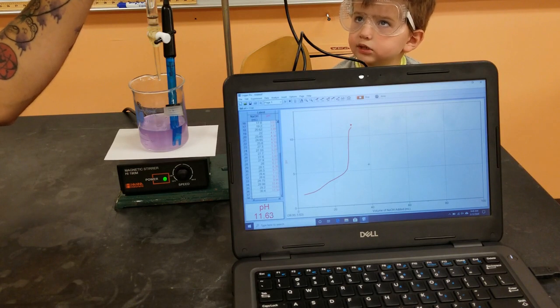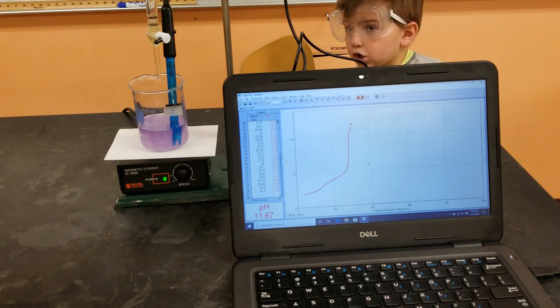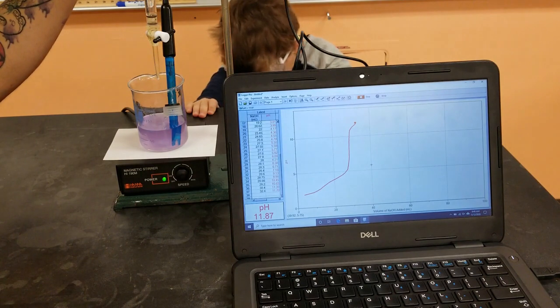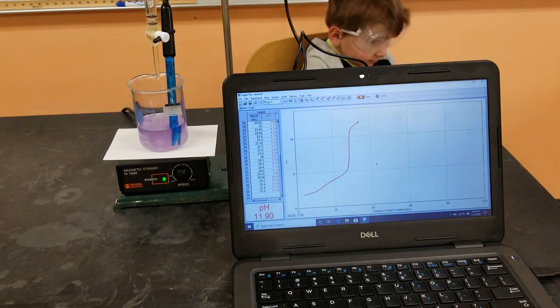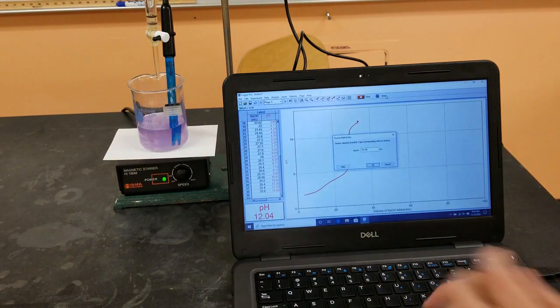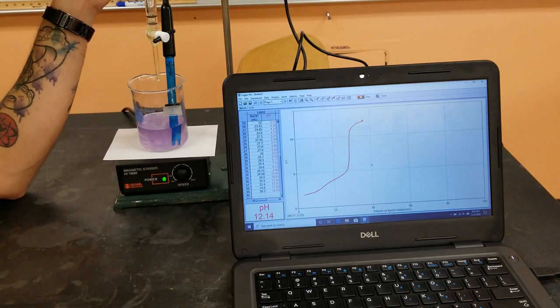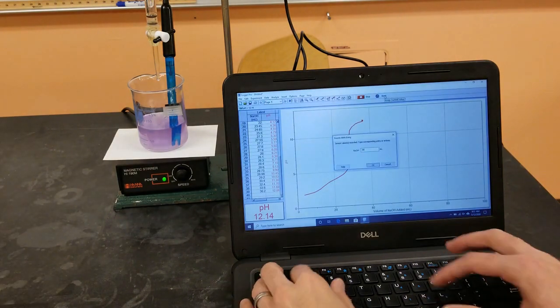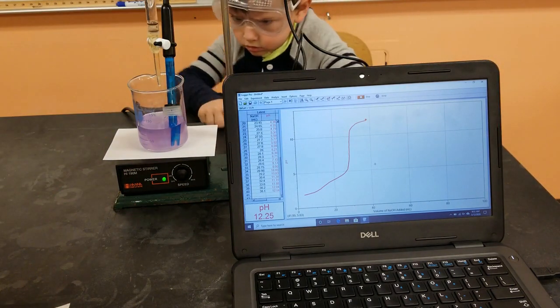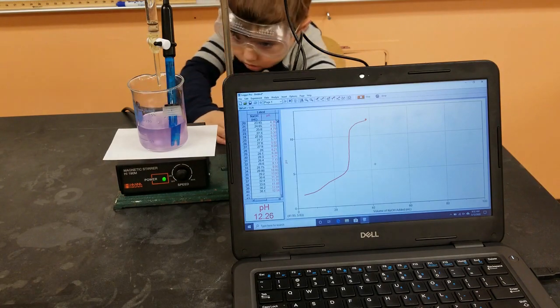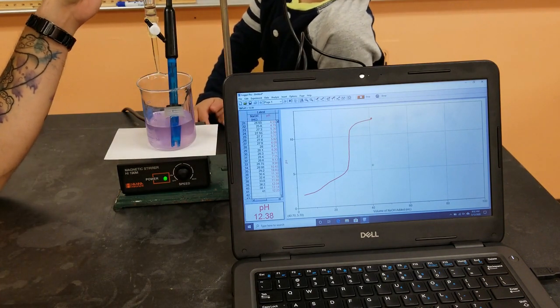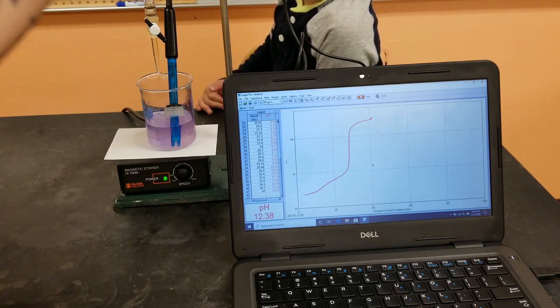Now we're at 32.40 milliliters, 33.80 milliliters, 36.20 milliliters, 38.10 milliliters, 41.00 milliliters, so that we have a nice graph here.